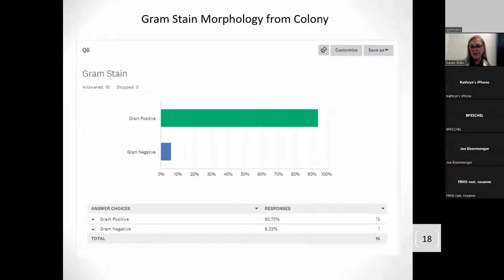Yes, Brad, we do think that it would probably be over decolorization. And I think you'll find that this is actually quite common with this organism. So it happens, and you have to, what is one way that you can figure out that it really was not a gram negative? Right? That's okay, Colleen, no problem. And I apologize, I called you Kathy, so I know better next time. What can we do to recognize over decolorization? What can a microbiologist use?